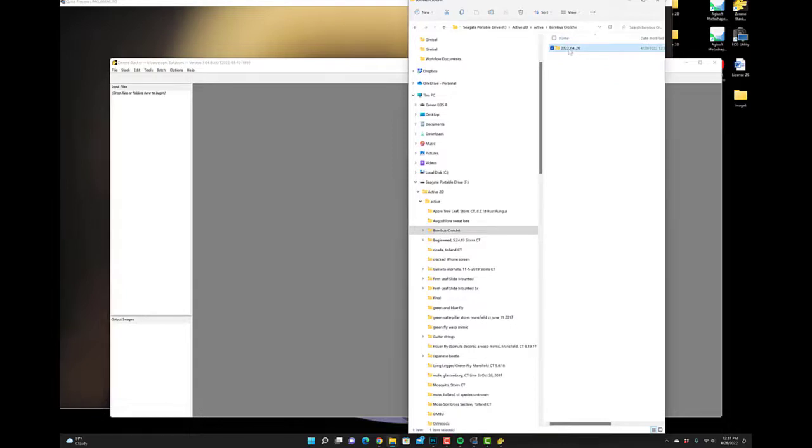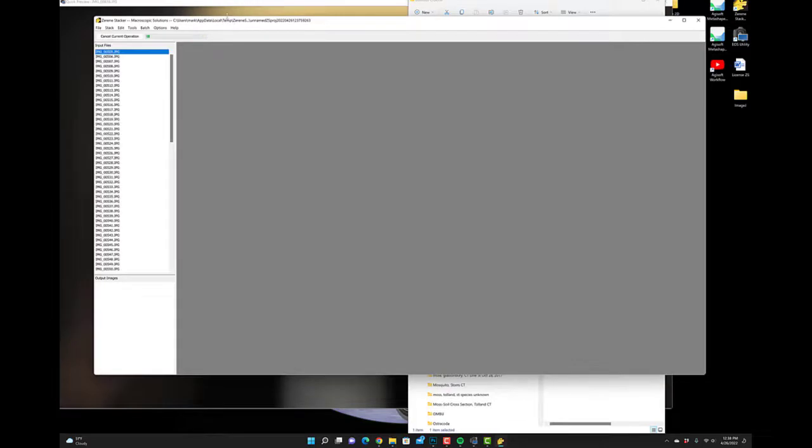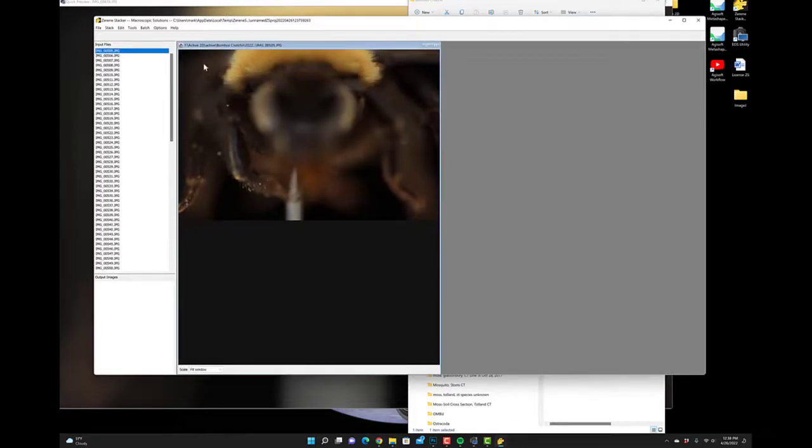So what I always like to do, in my folder here, so that it doesn't stop me from taking more images, is add a 1 behind the name, and then add the magnification that I had used to keep track. So we'll add a 1 and then a 3x. I'm going to drag the entire folder over to Zerene Stacker. Remember, we're going to stack from back to front when we're at 1 to 5x, not front to back.